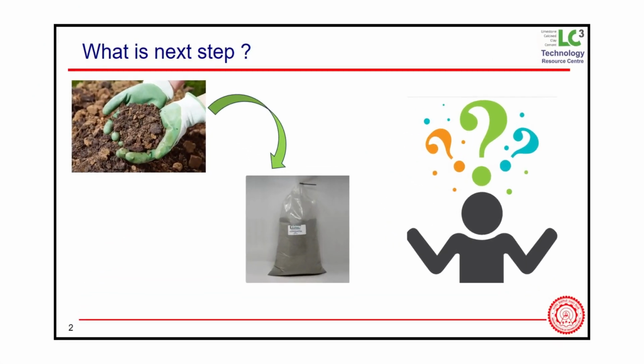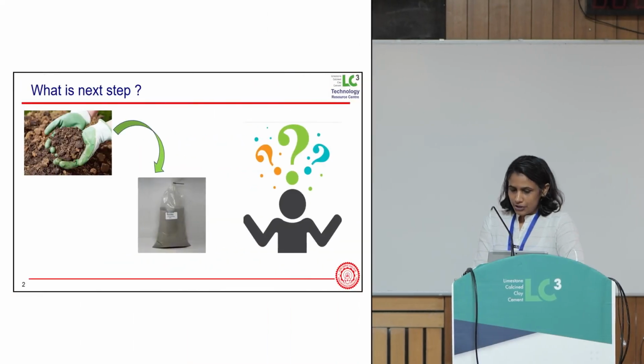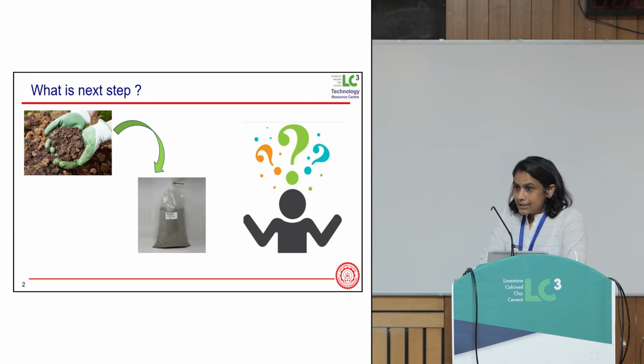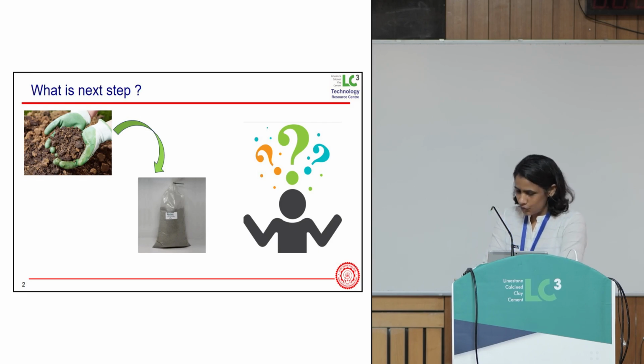Once you are handed the samples from the site that were sent by the geologist, what is the next step that you will be doing in your laboratory? Here I will be speaking about the techniques that you can use for identifying or qualifying whether a particular clay is suitable for the production of LC3 or not. All these techniques you will be able to explore in this workshop during our practical session 2.